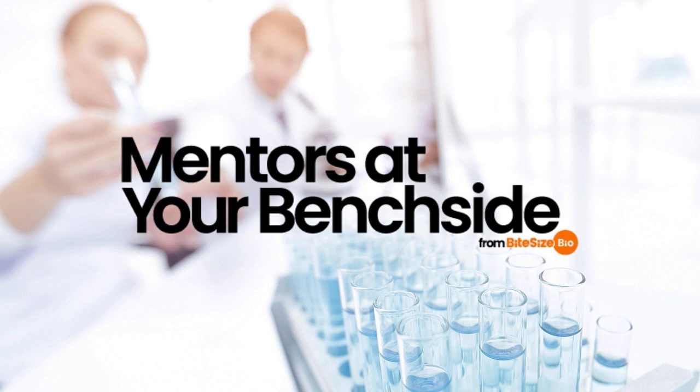Tip number 3, operate in the appropriate range with correct parameters. Always use tools that are designed and calibrated to work in the range you are measuring or dispensing. For example, don't try to measure OD600 beyond an absorption of 1.0, since optical density, OD, readings this high are beyond the dynamic range of most spectrophotometers. If you are ever unsure about using an instrument to measure accurately at an extreme value, reach out to a trusted peer or mentor for advice.